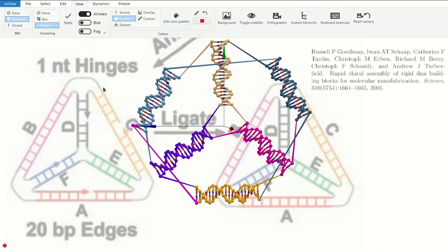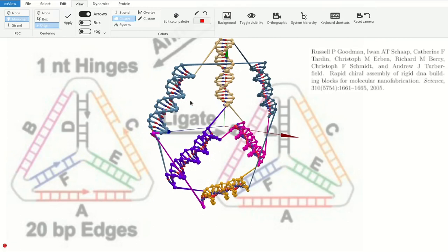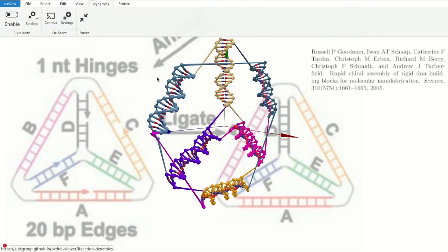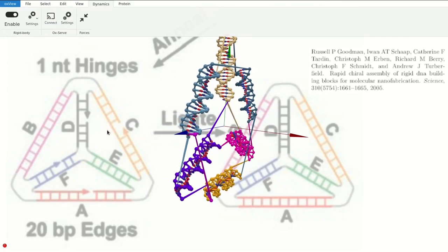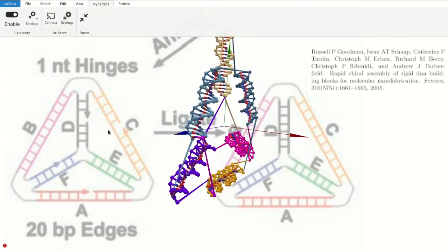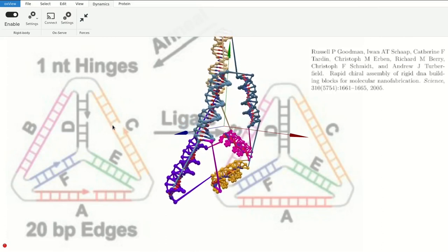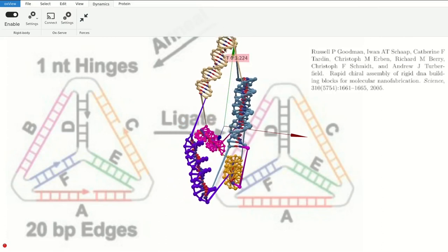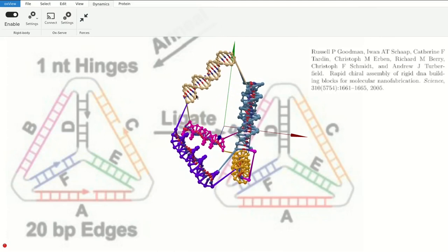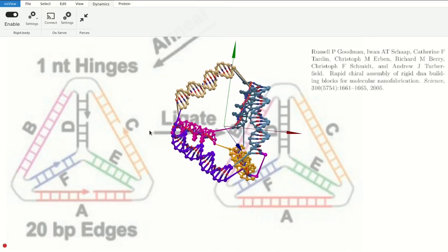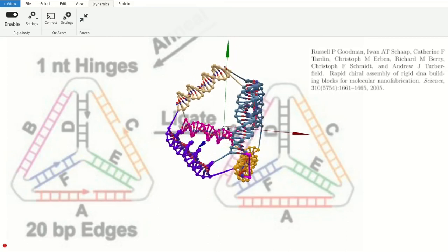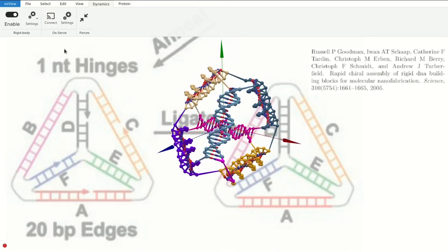Everything is still in one plane, as you can see, and we want it to be a tetrahedron. Since everything is its own cluster, we can just enable rigid body dynamics, which will move the clusters so that they have a repulsion force between them, but also a spring relaxation force between the bonds that go across the clusters. So it automatically goes into something looking more like a tetrahedron.